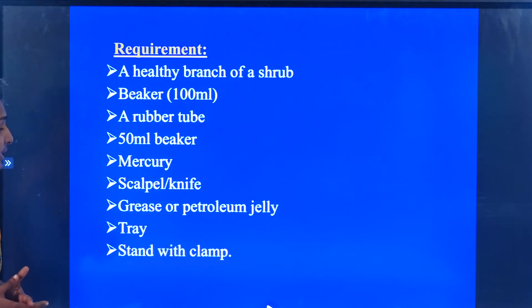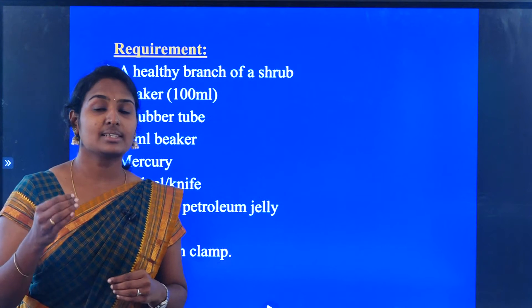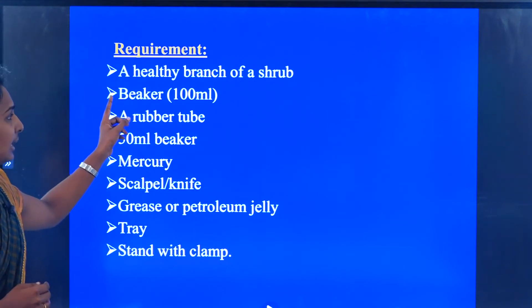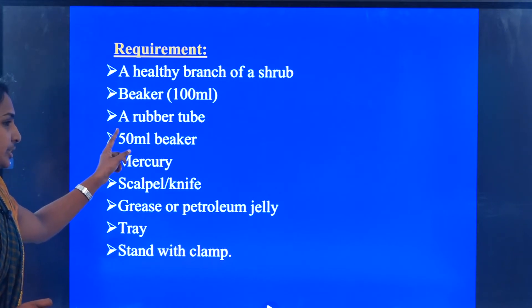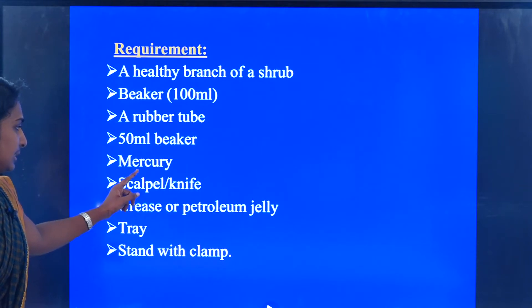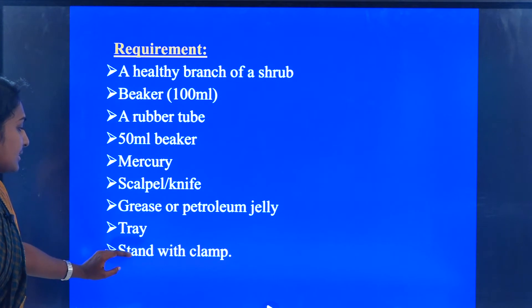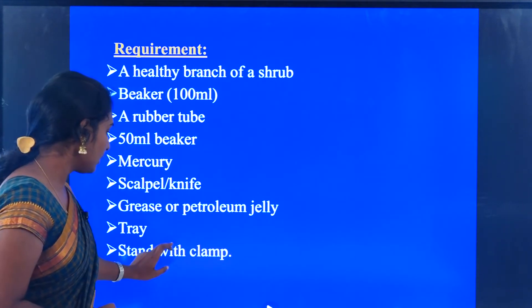Moving on to the experiment. For the conduction of this transpiration pull experiment, the requirements we need are: a healthy branch of shrub, a beaker, a rubber tube, a 50 ml beaker, mercury, a knife, petroleum jelly, a tray, and a stand with a clamp.